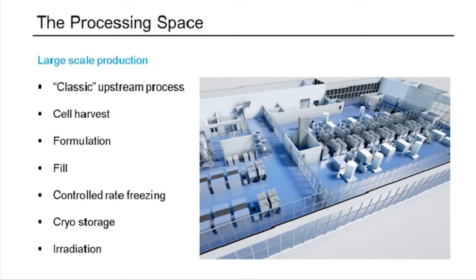And what we're finding is that this resembles much closer to a classic monoclonal antibody production in terms of upstream. Typically, your specific cell selection, activation, manipulation is all done prior to floor manufacturing so that you can set up a cell bank for consistency. And so then this looks a lot like what you would see in terms of upstream for a monoclonal antibody facility, where you have a cell bank, and then you are thawing that working cell bank vial. You are going through cell expansion, and then there is a harvest step.